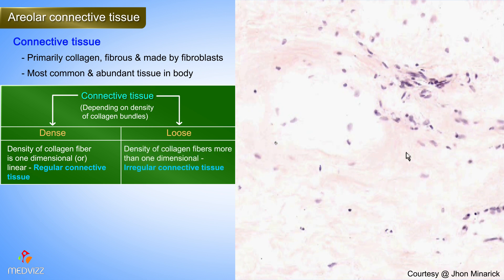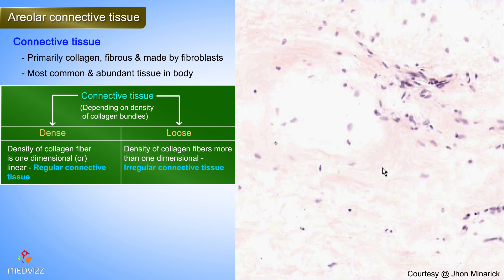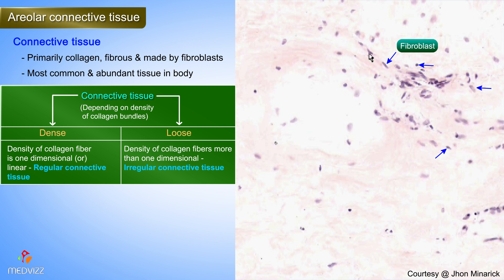When you see collagen fibers which seem to go every which way, that's what we call irregular connective tissue. Dense connective tissue is more likely to be regular or tendinous, and loose connective tissue is more likely to have fibers going every which way. A general rule of thumb is that every spindly-looking cell within connective tissue of any type is a fibroblast until proven otherwise.